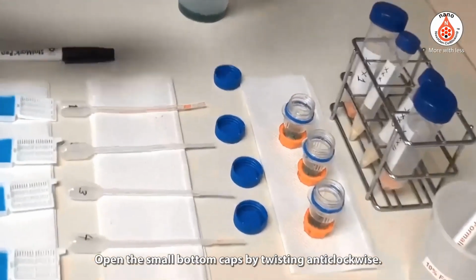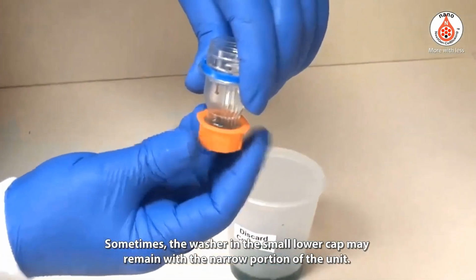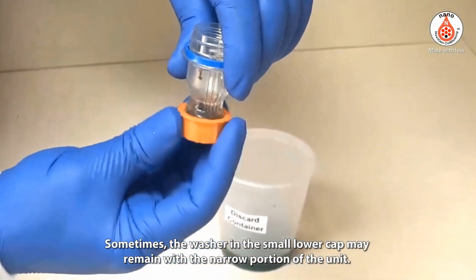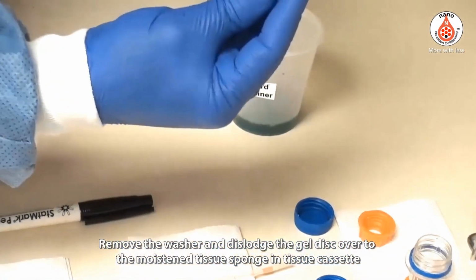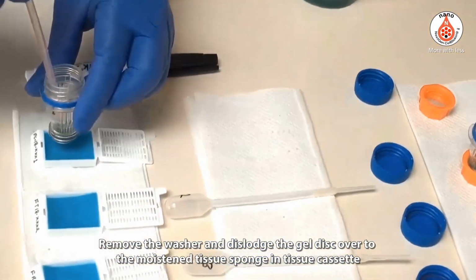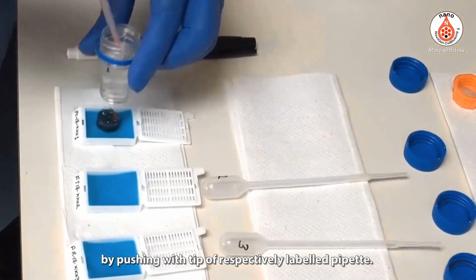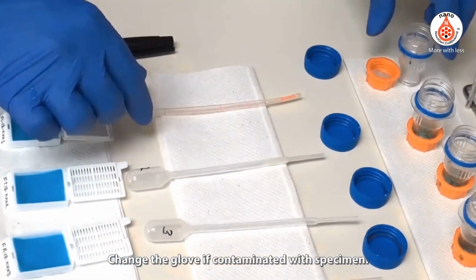Open the small bottom caps by twisting anti-clockwise. Sometimes, the washer in the small lower cap may remain with the narrow portion of the unit. Remove the washer and dislodge the gel disc over to the moistened tissue sponge in the tissue cassette by pushing with the tip of the respectively labeled pipette. Change the glove if contaminated with specimen.